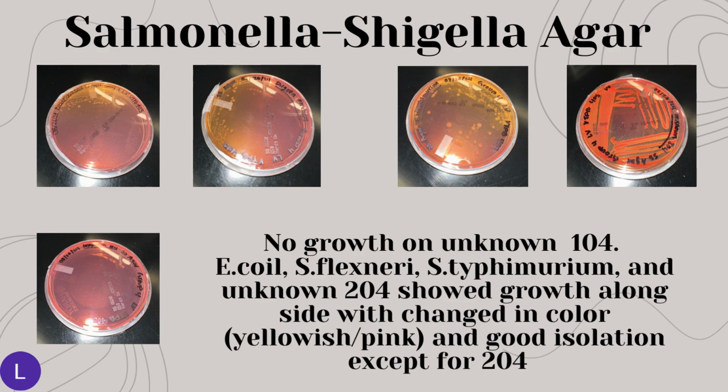And I would like to point out that for that petri dish, we did a streak plate, but we did it with a plastic loop. So that could have been one of the reasons.